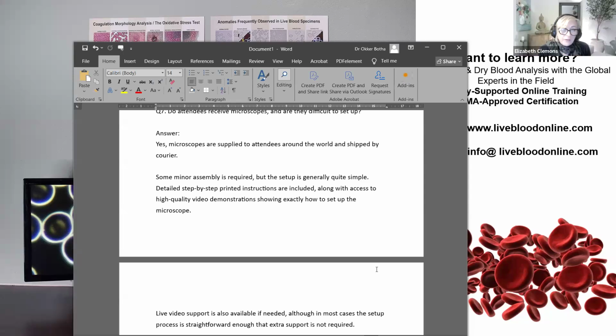And you might have already answered this question. Why is it important to choose the right microscope? Well, the main factor there is dark field. If your microscope does not have the correct features for dark field, and just briefly, the first and most important thing to check would be the strength of the light source.